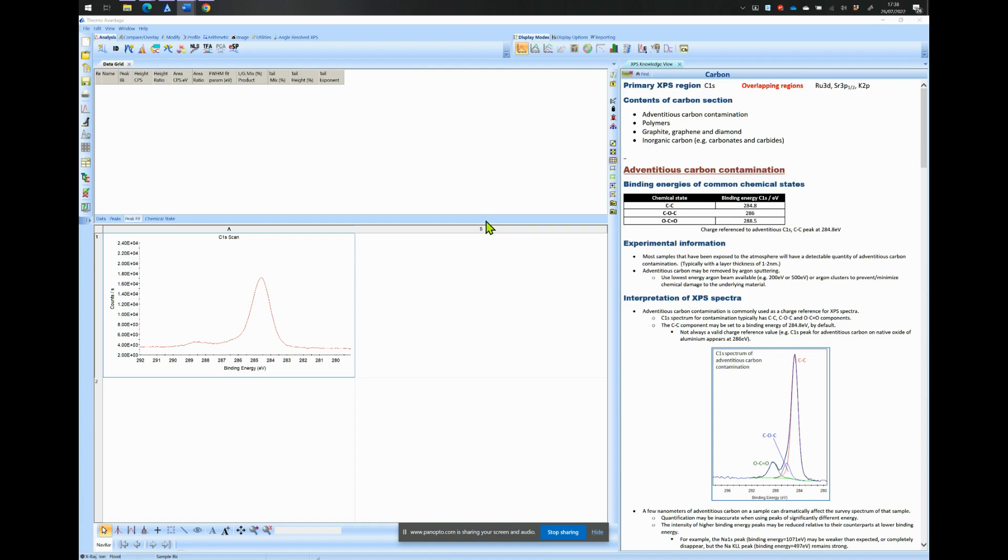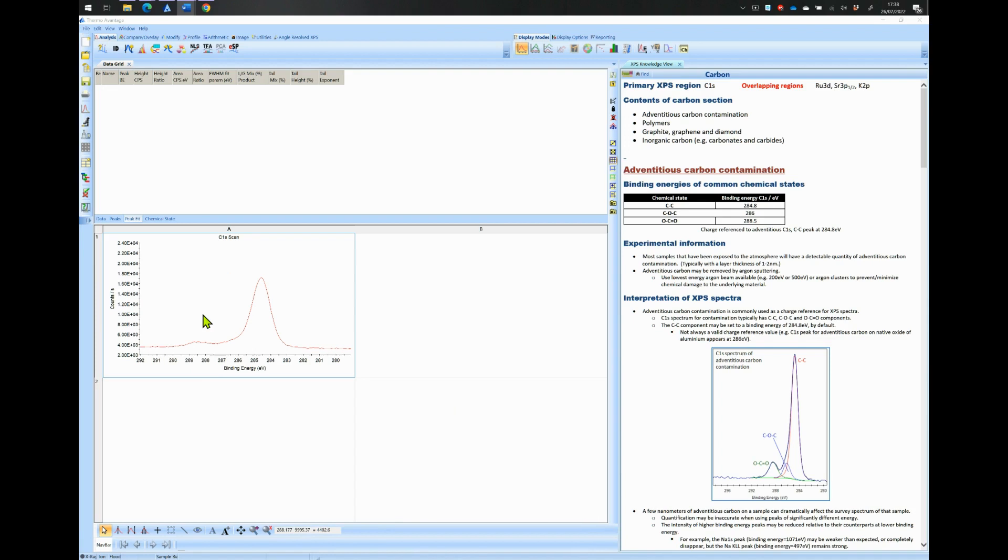This is a spectrum of a standard carbon 1s core level which arises from contamination on the surface of your sample. In XPS, the carbon 1s core level is always measured in order to correct any shift that may have occurred due to local sample charging. I have placed a knowledge view on the side to help identify the different species.